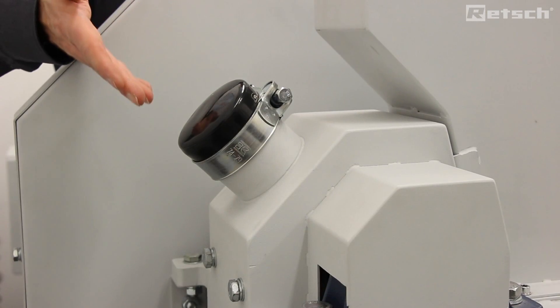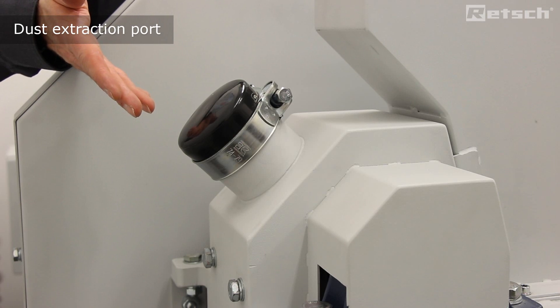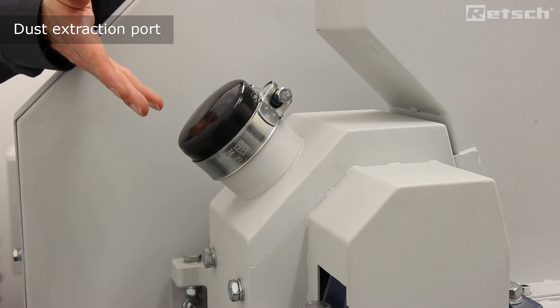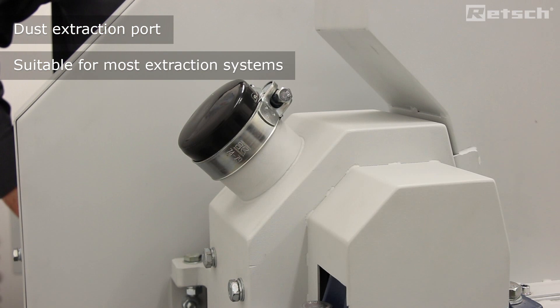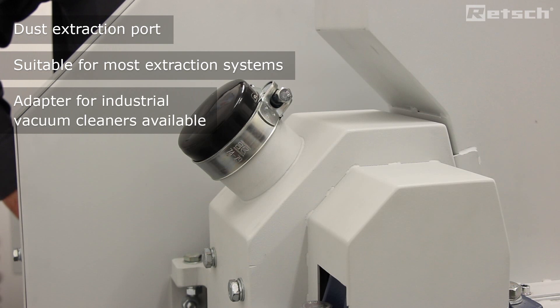On the rear of the instrument we see a standard size dust extraction port which will be compatible for use with most dust extraction systems. Also available is an adapter if the client wishes to use an industrial vacuum cleaner.